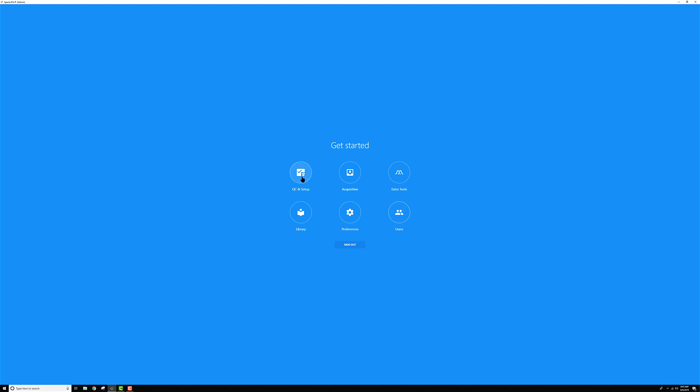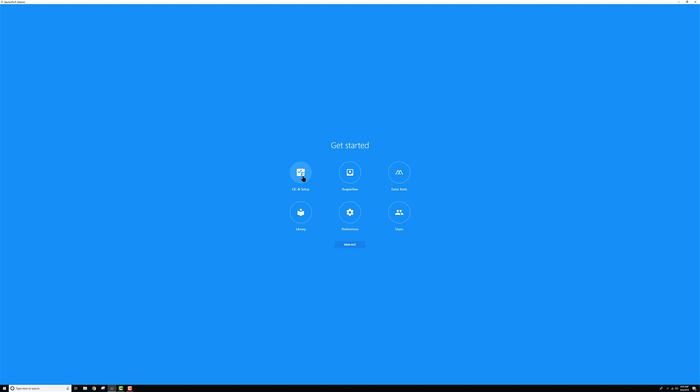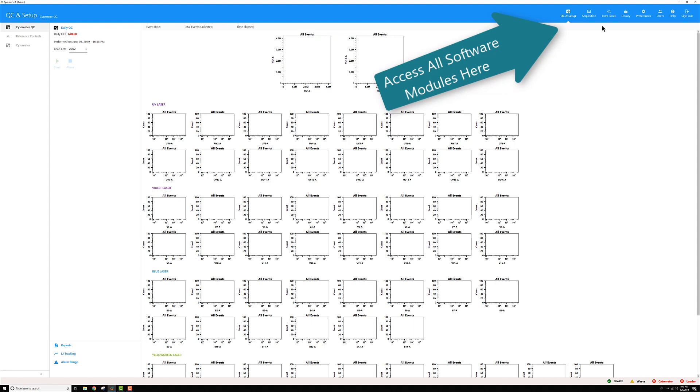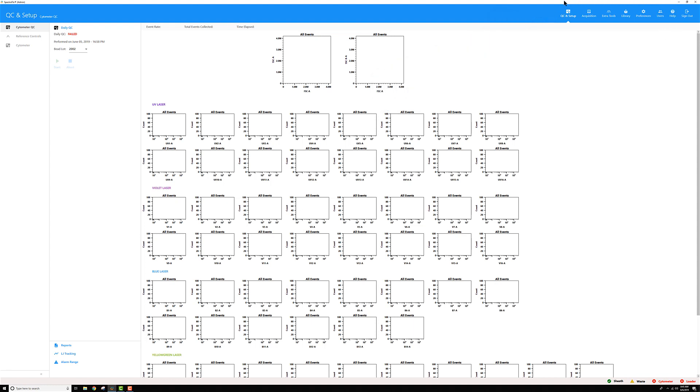So let's go ahead and open one of these up. We'll go to QC and setup first. Now when the page loads, you can see the way things are organized in the software. Those six modules are always going to appear in the top right of the software here.